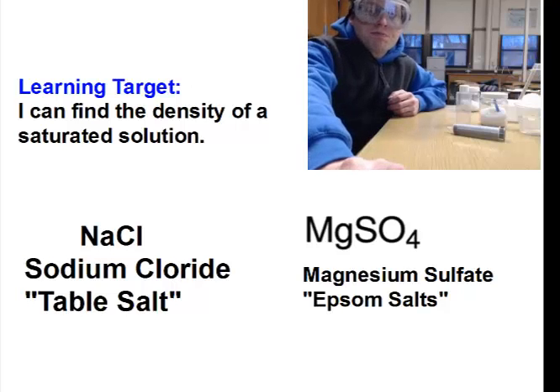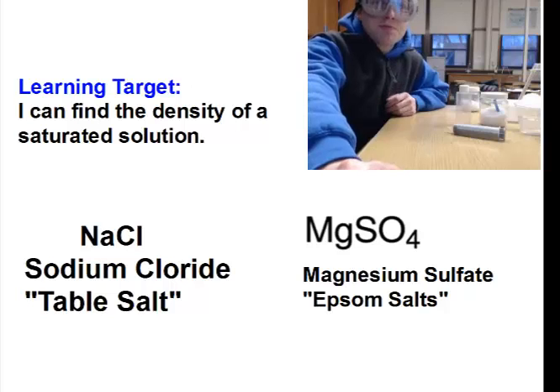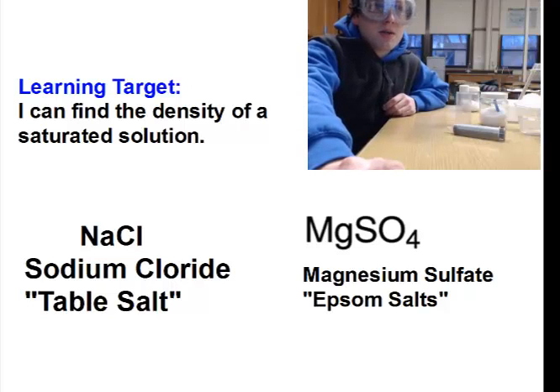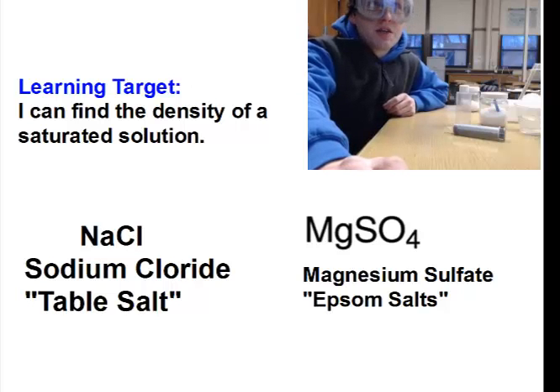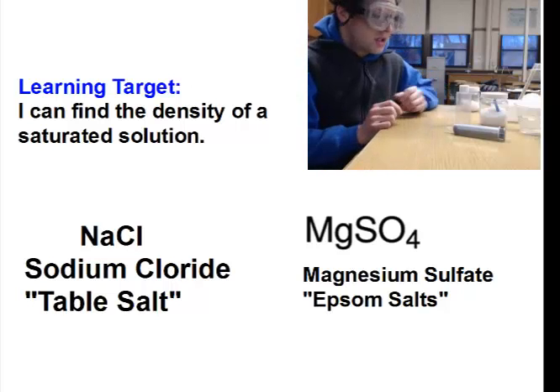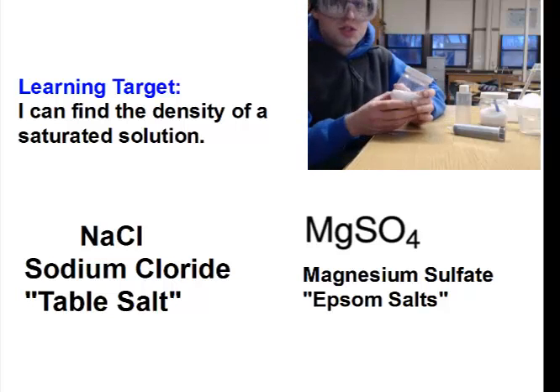Hey everybody, it's time for another science lab. Today you're going to learn about making saturated solutions. Your learning target is I can find the density of a saturated solution. You're going to be using two substances which you're familiar with.